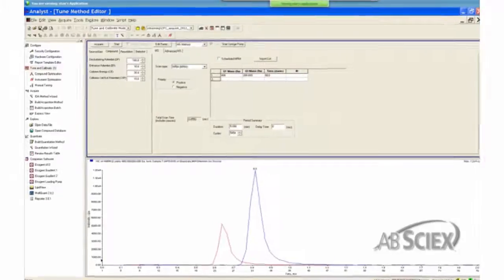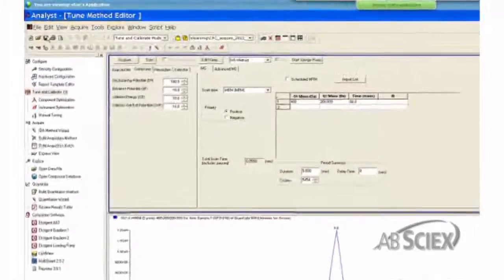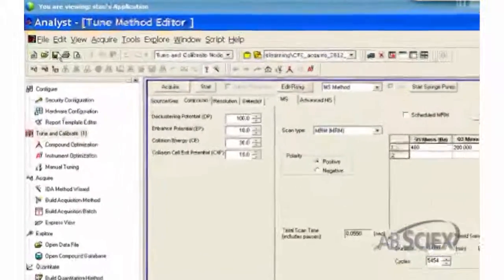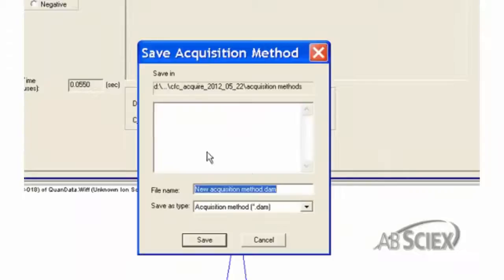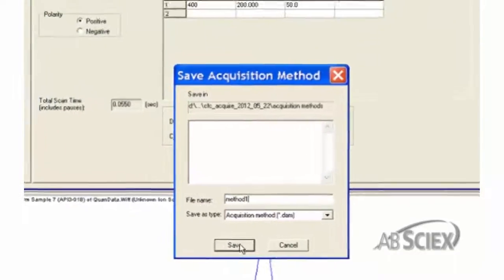There are two ways to save an acquisition method. The first way is to use the Save button. Click on the Save button, then either give the method a name or click on the method you want to overwrite.